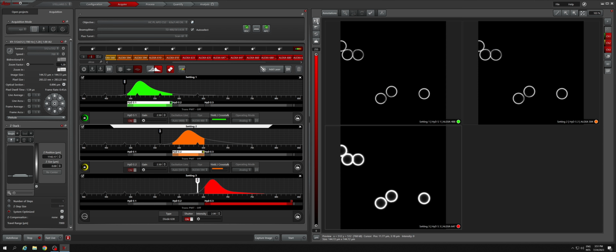And then the third one, we'll just go back. The first time you click it, it goes to grayscale. You have to click it a second time to go to color. And yeah, now I'm just adjusting the third one down as well, so now they all should be pretty good. And it's just handy to have that over and under exposure button to double check that you're not too bright.